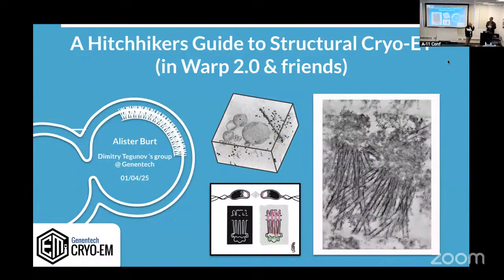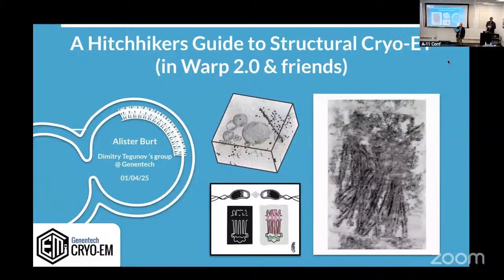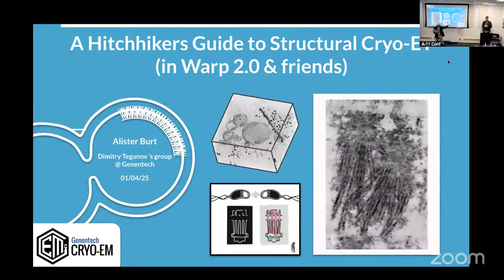So you know, now I think about it, we should coordinate. Like Laura, you should have used 42 tilt series, 42 micrographs, because that would be the correct answer.